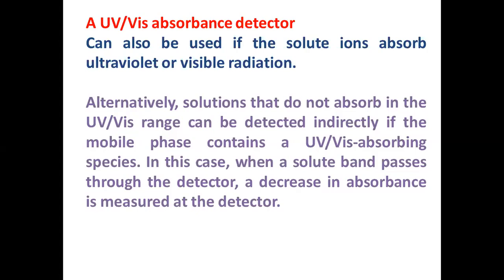In those cases, we can have an alternate arrangement in such a way that if the solute is not going to absorb any UV or visible radiation reaching the detector, we can take the variation in the absorption between the absorption of the mobile phase and the absorption of the solute molecule.